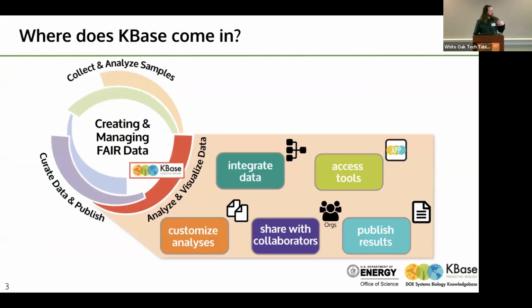So again, one of the things that makes KBase very unique is that we can work together on the platform. So if you've, for instance, assembled and annotated a genome and you want to share it with your colleagues to analyze it together, you can do that within the narratives, and I'll show you how to do that in a bit.